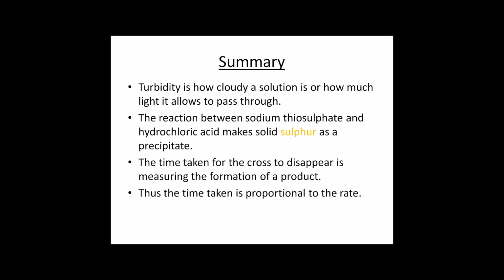And thus the time taken for the cross to disappear is proportional to the rate. The faster the cross disappears, the faster the rate. The slower it takes for the cross to disappear, the slower the rate. Nice and simple.